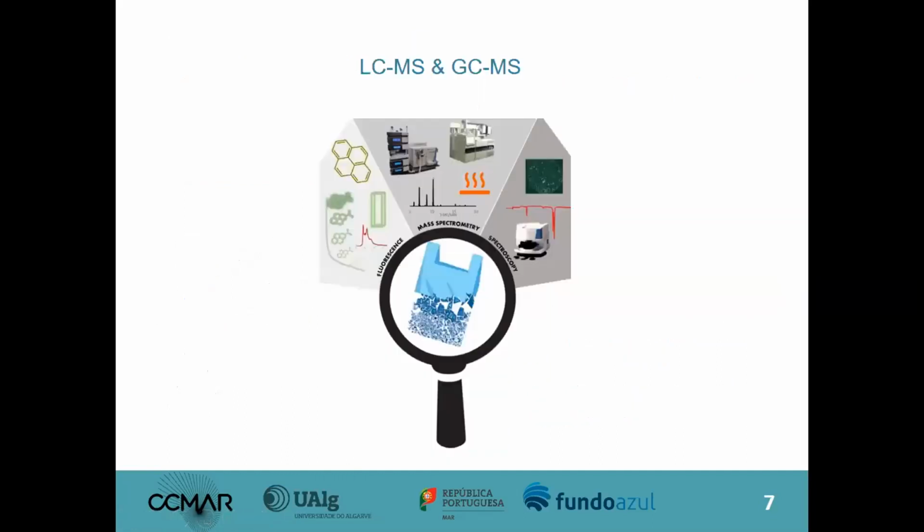Now the other group of methods here, that's the LCMS and GCMS. Let's start with the LCMS. I will not show results from our LCMS. This probably can be a second seminar. I will present some results of others and explain what is behind the use of LCMS to analyze microplastics.